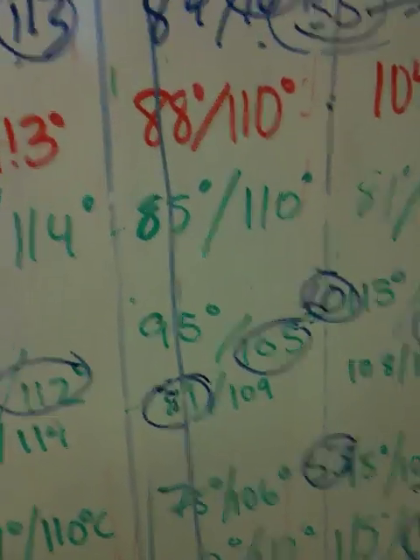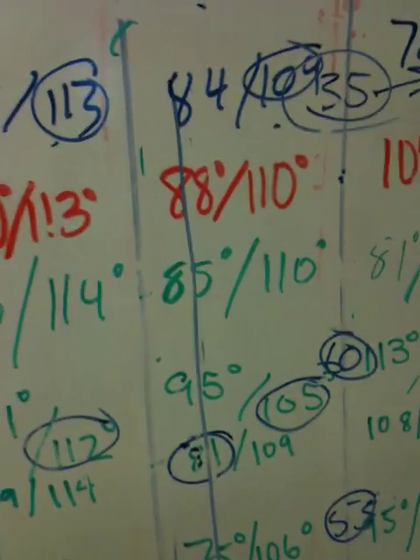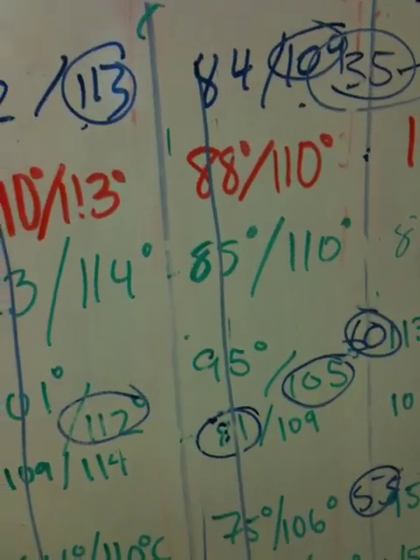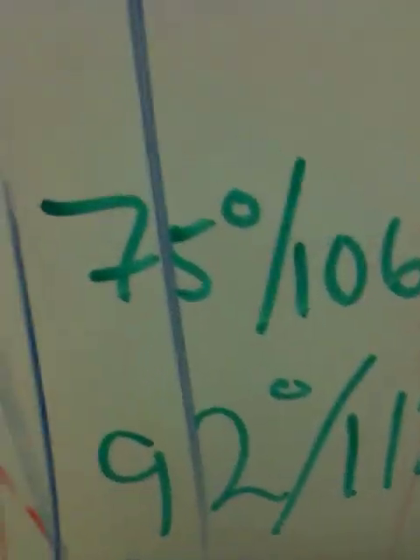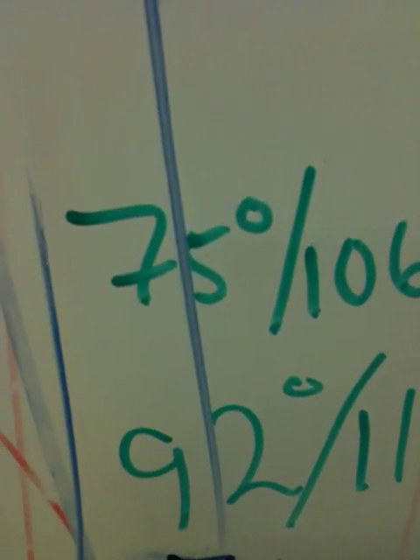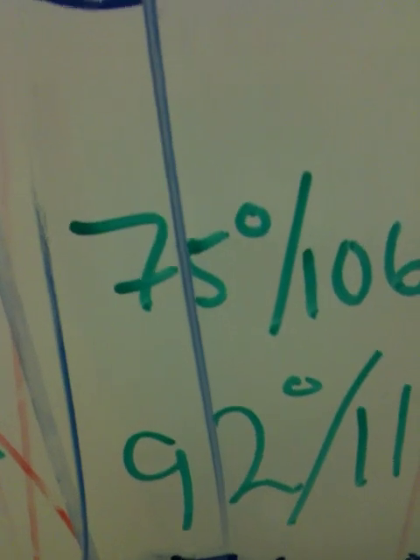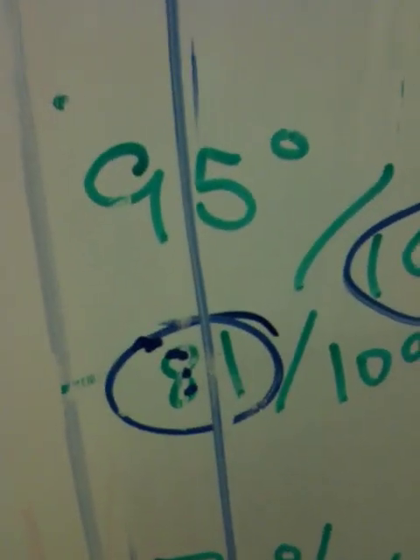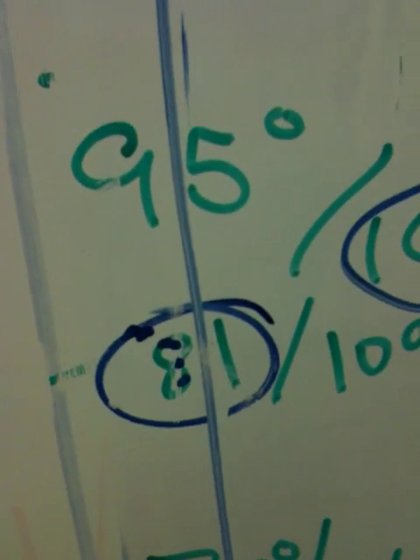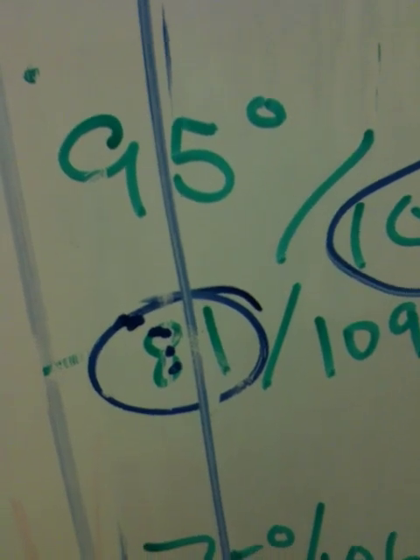Again, this is due to people's perception of the beginning of melting, and some people really perceive changes in crystal structure, and those are the people that tend to be very, very low, and they are also probably recording the very first perception of sweating or some kind of crystalline change. And the people who are higher, maybe up at 95, they either don't perceive that initial change or they are really writing down the first drop of liquid, okay?